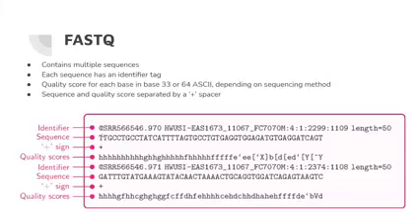So a score of 1 would be, you're better off just rolling a dice and guessing the base, whereas 64 is 100% certain that that is the base. And that's just based off of signal strength from your cluster reads when you have a look at the flow cell. And yeah, your sequence here in A, T, C's, and G's, and your quality scores here are separated by a plus spacer, although sometimes they might use a different symbol. That's just to separate the lines, make it look pretty.